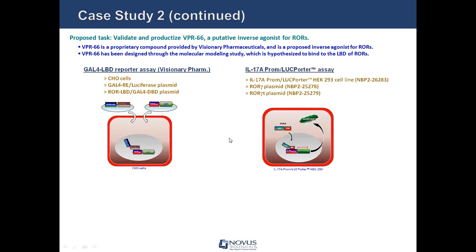And we used our IL-17A promoter luciferase reporter cell line, and used intact ROR gamma T protein for inducing this IL-17A promoter activity.